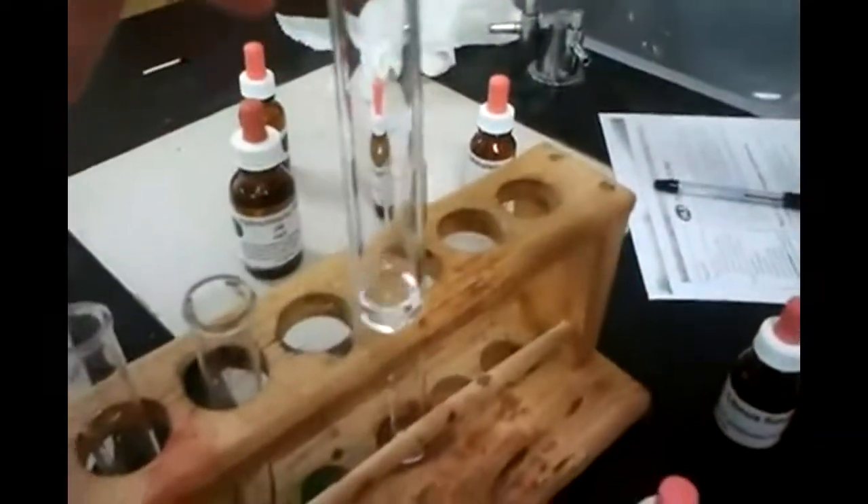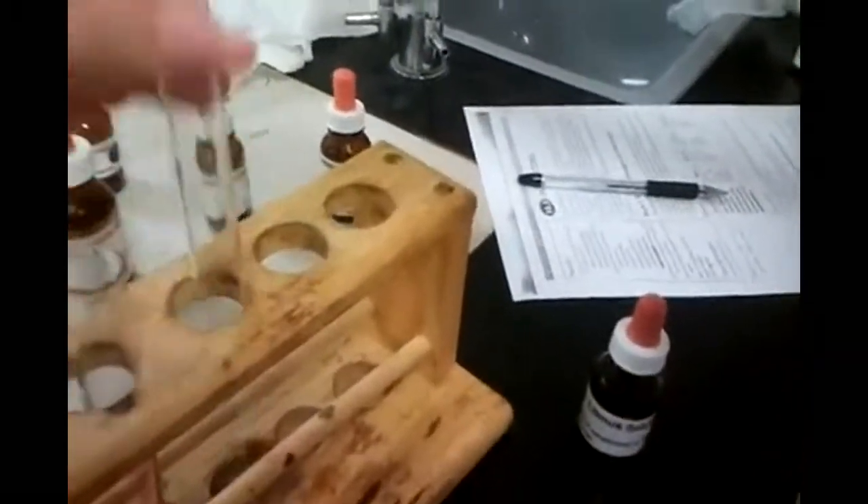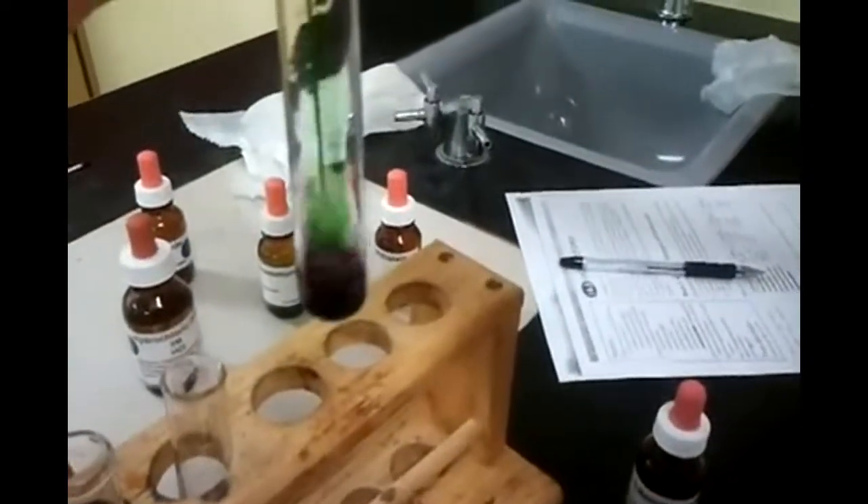And then this one's an acid, so it should be red of some sort. See, red. You see it, I see it — Christmas colors. And then this one should be purple because it's a base. Oh, that looks kind of black but it's actually purple.